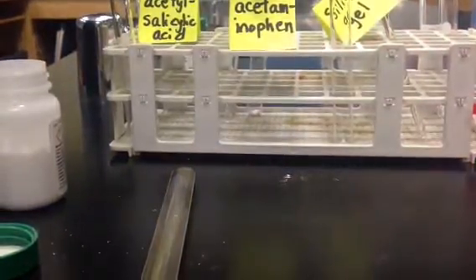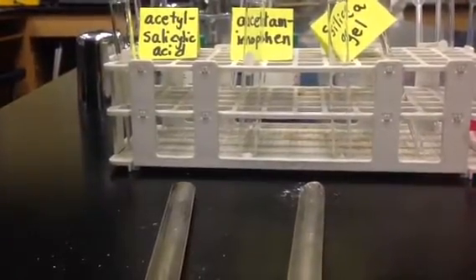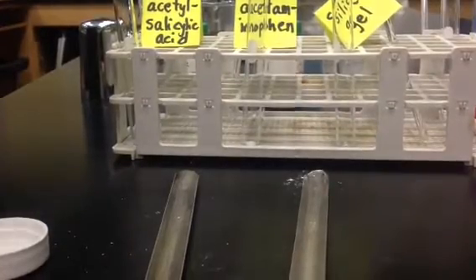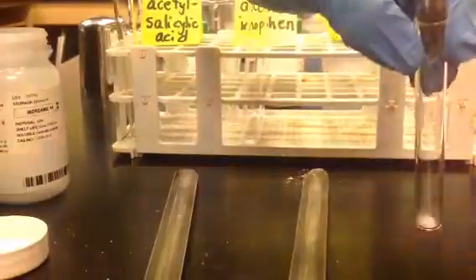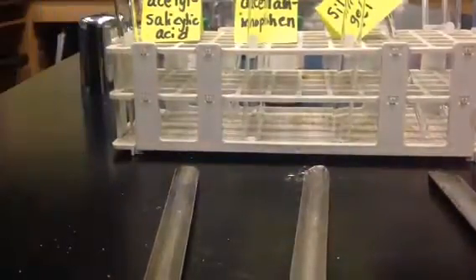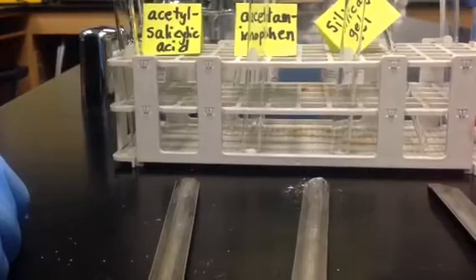The reason is because if you use too much, it takes too much of the solvent to get it to dissolve. All we're trying to do is put enough in there where we can see, is it dissolving in the solvent, yes or no. And the last one is the silica gel. And we're going to use about that much of the silica gel. So when you have a very small amount of the component, we're going to add the ethyl acetate as our solvent.